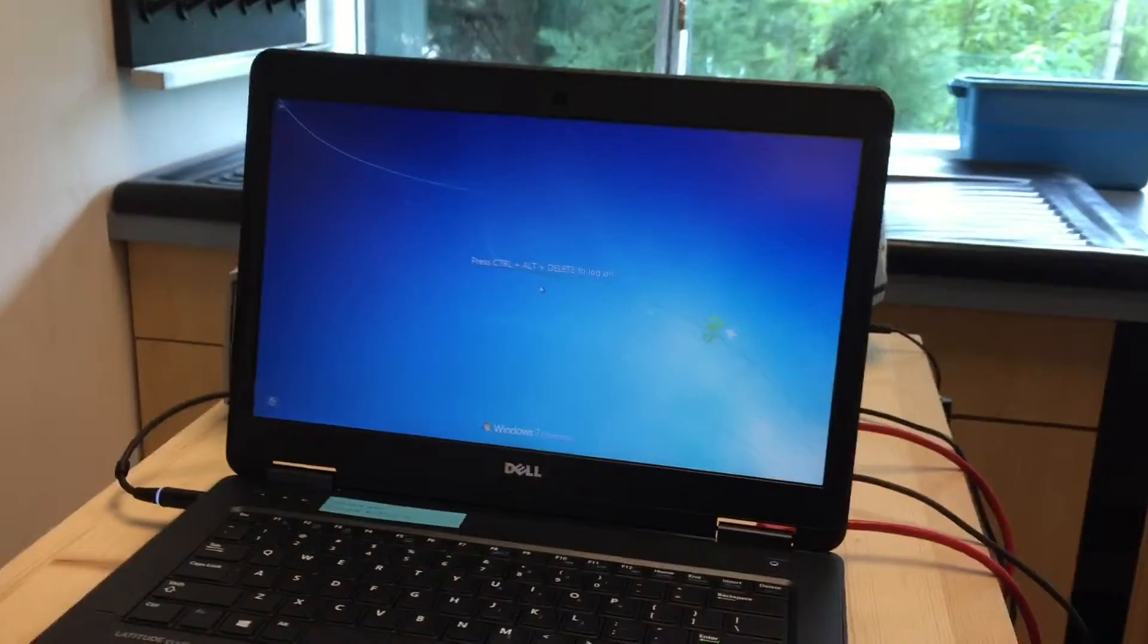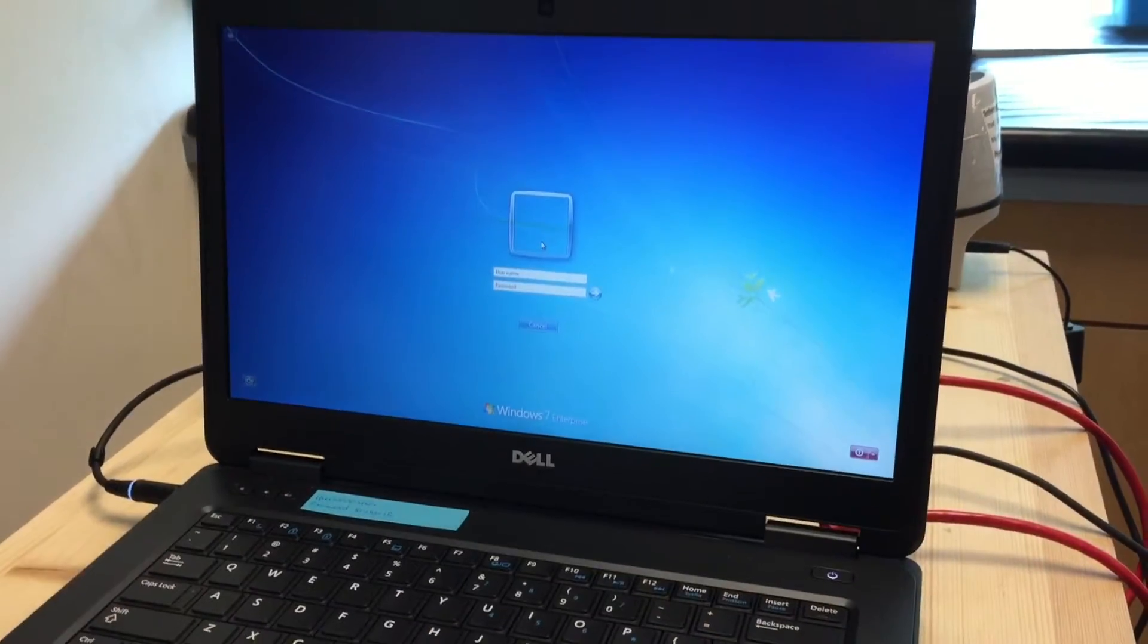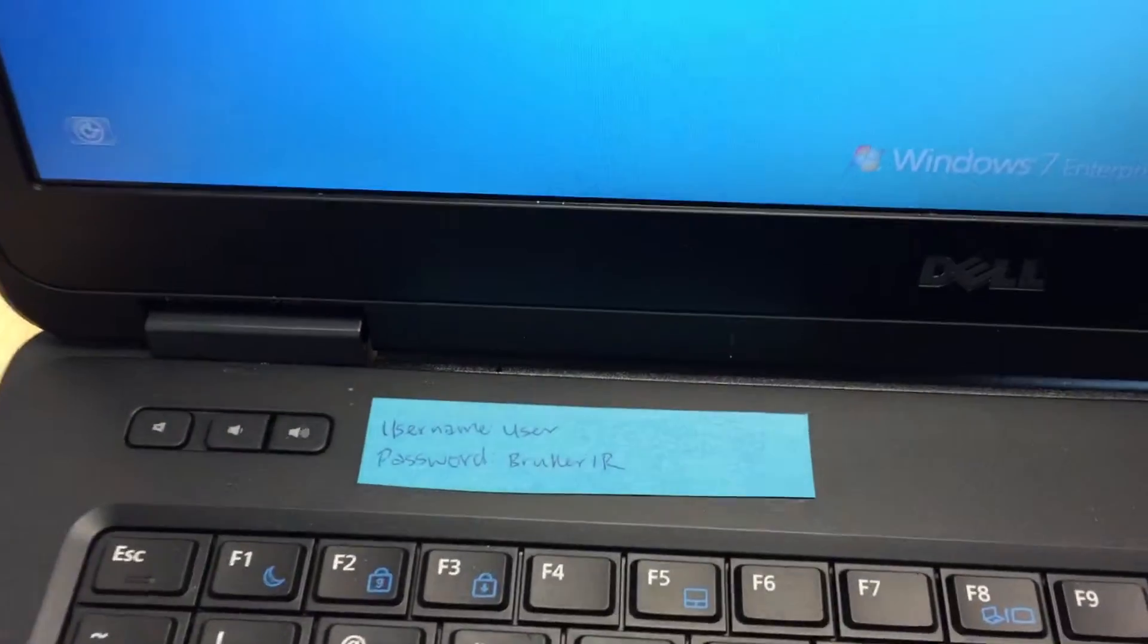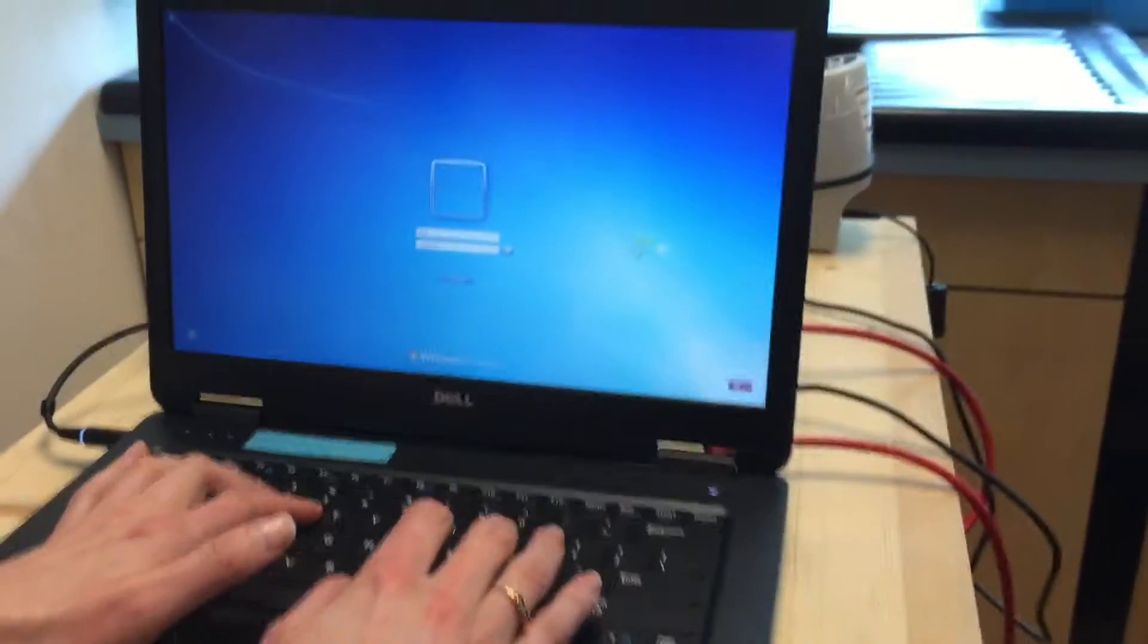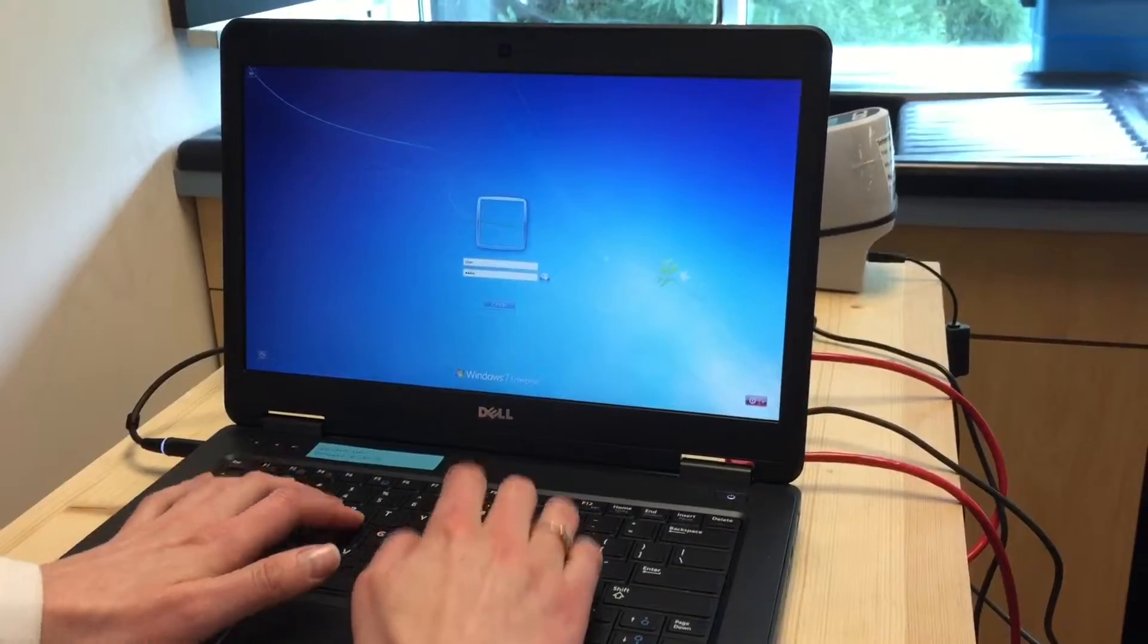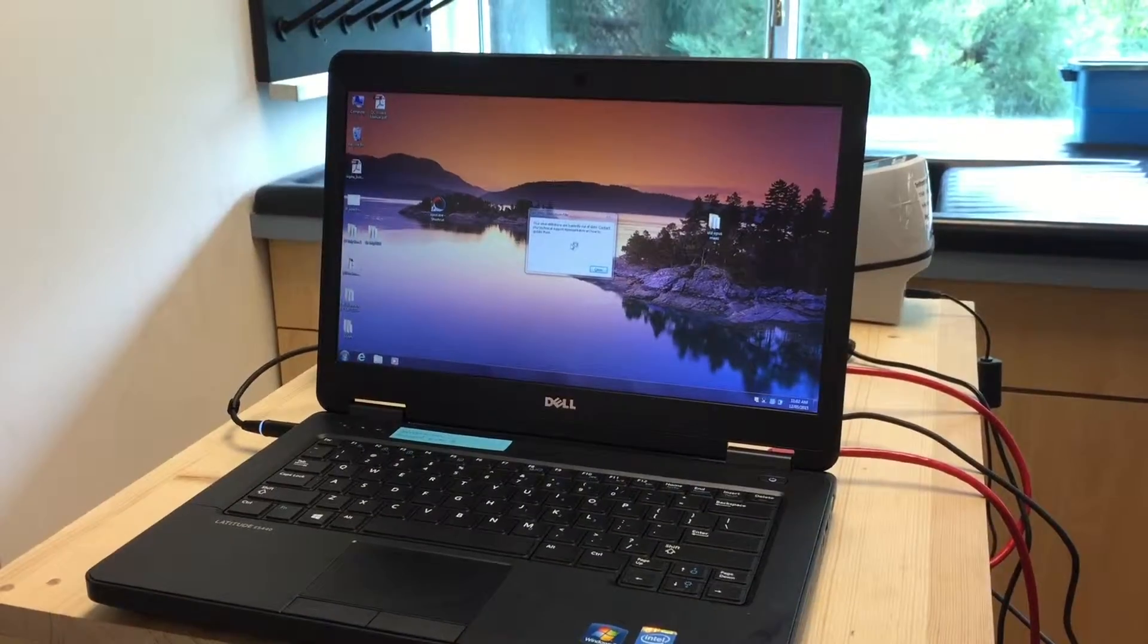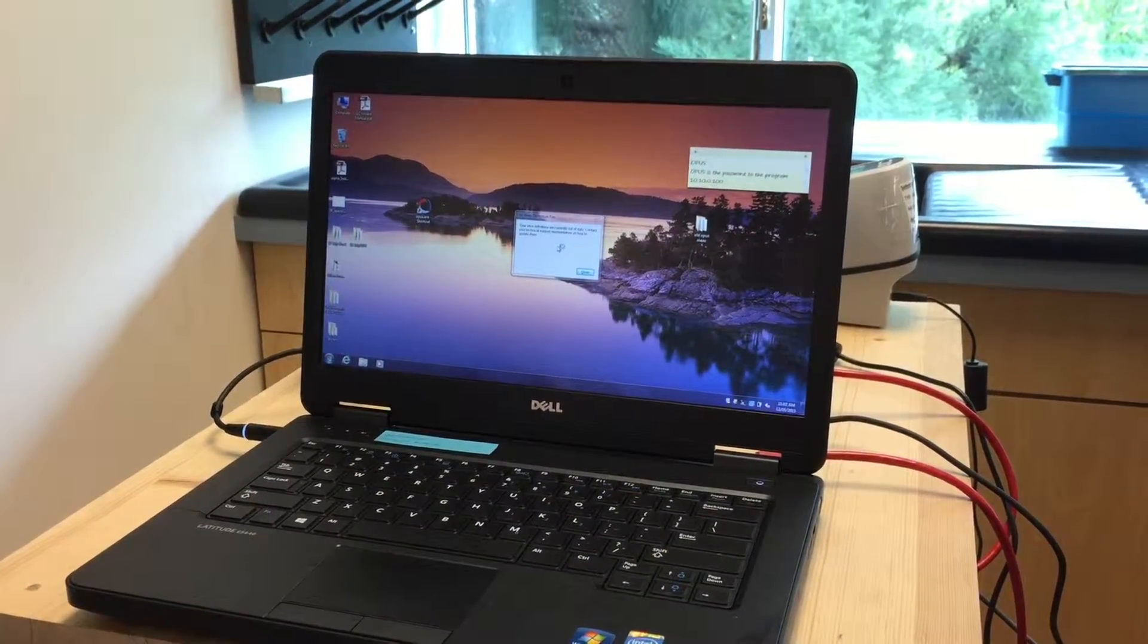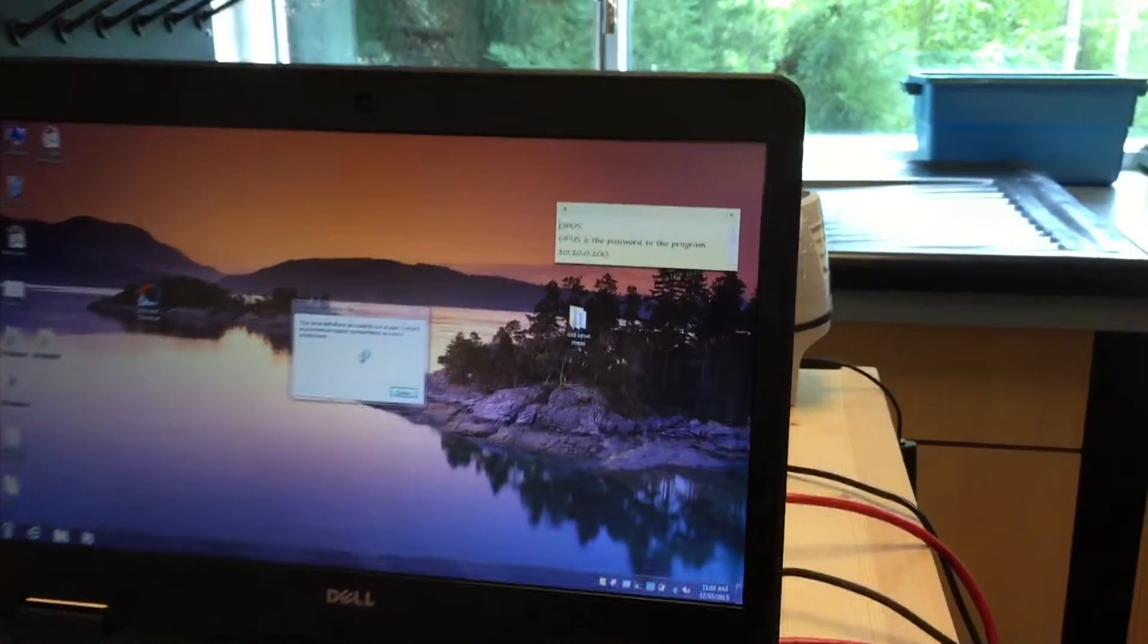The password to this computer is written on the sticky note right here. The username is 'user' and password is 'BrukerIR'. I'm going to put it in.